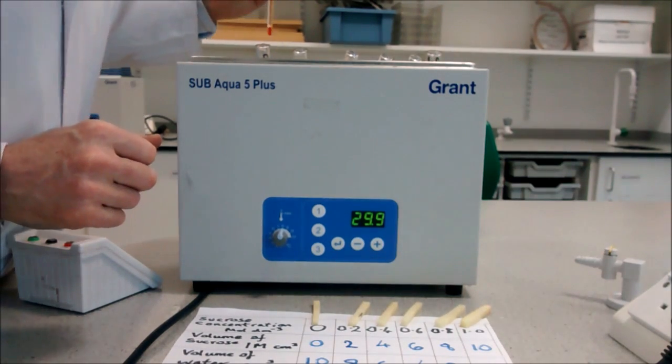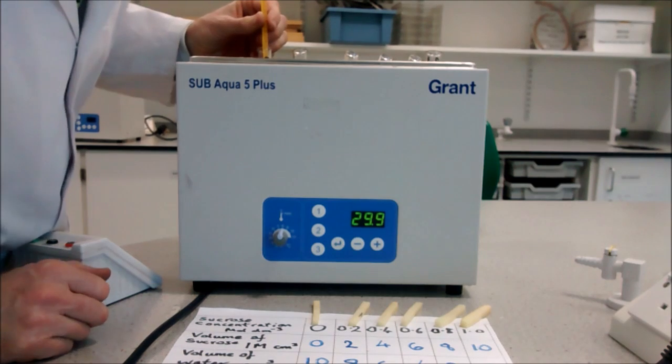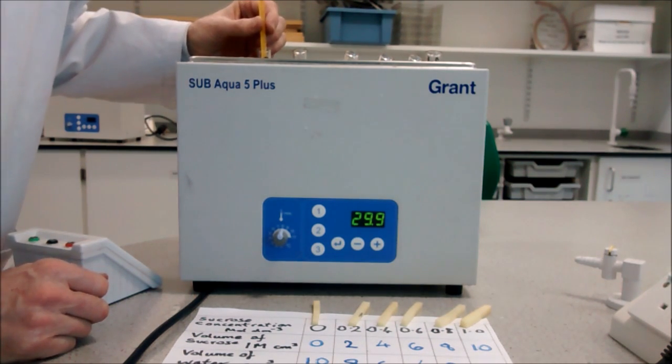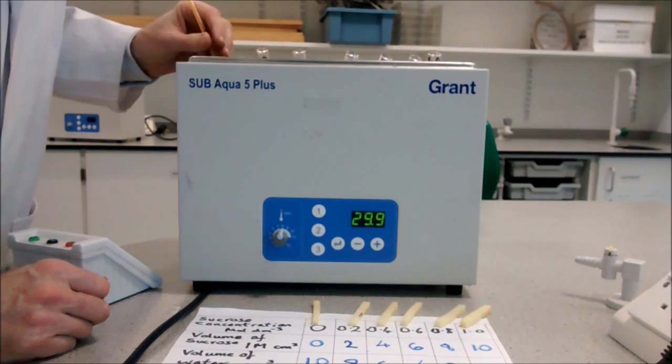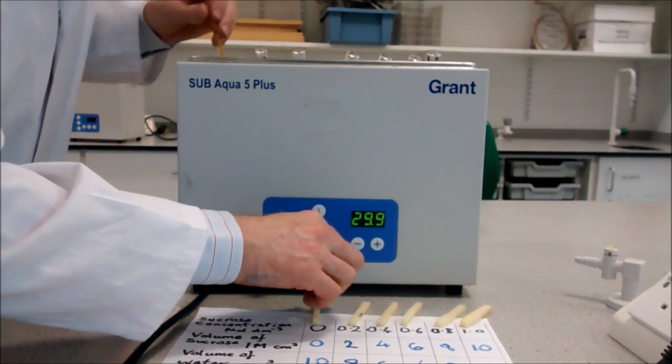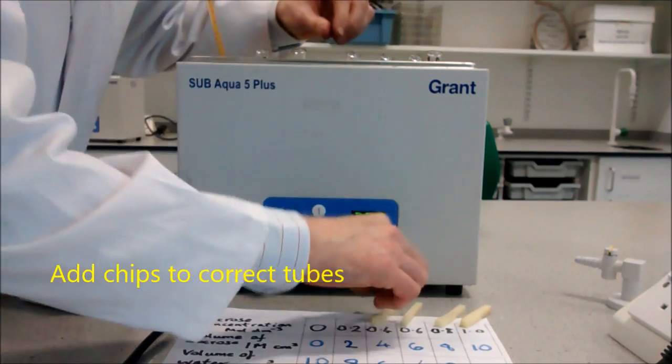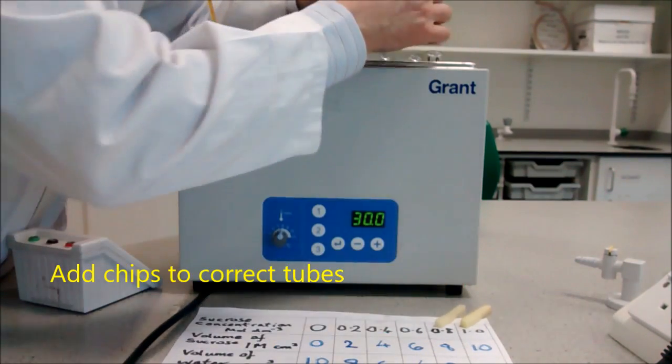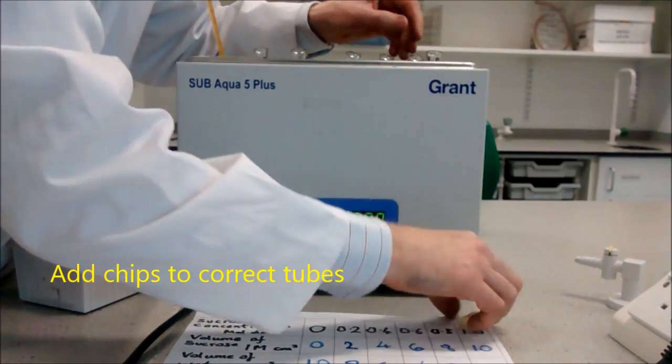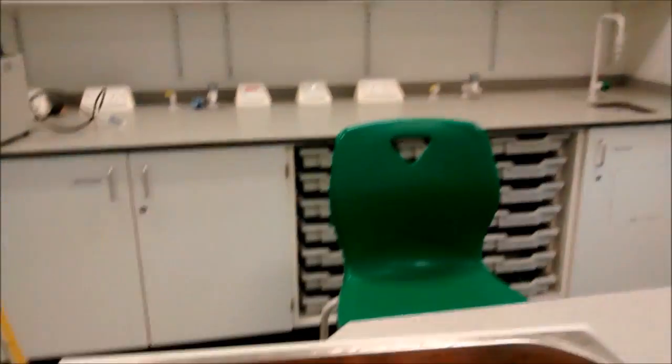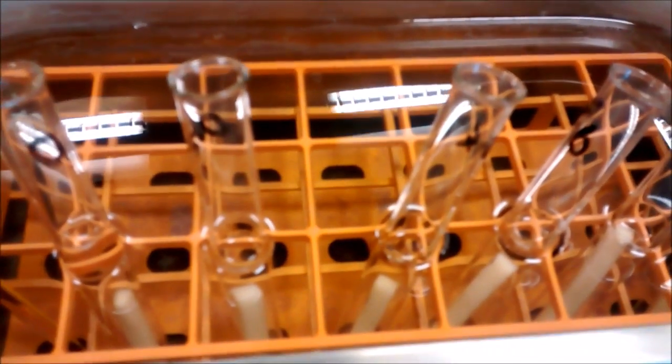When your tubes have come to constant temperature, in this case twenty-eight degrees Celsius, quickly add your chips to each tube: one, two, three, four, five, six. The chips remain in the water bath and should stay there for fifteen to twenty minutes.